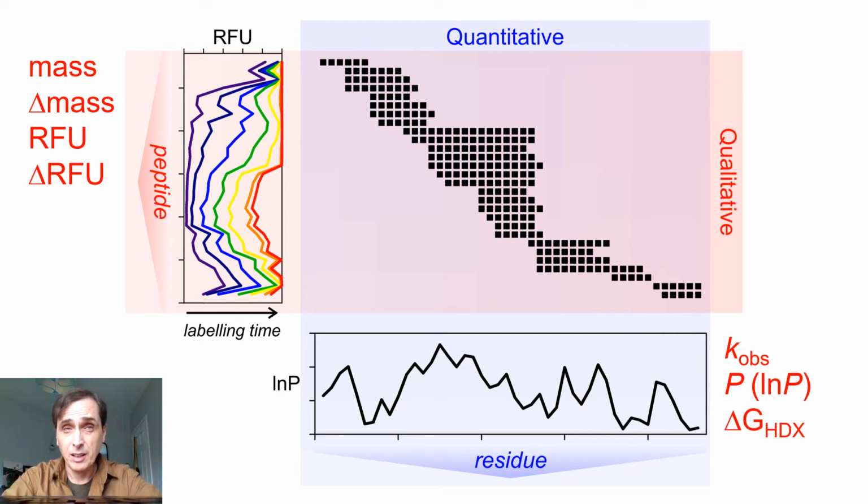So then you get really a measure of the stability of each amino acid. So it's highly localized information, and it's really these metrics which are the essence of high resolution HDXMS for me, and also why I find data optimization quite exciting. And the thing is that this information is embedded in the experimental data, even on the peptide level, and we just need some way to extract it.